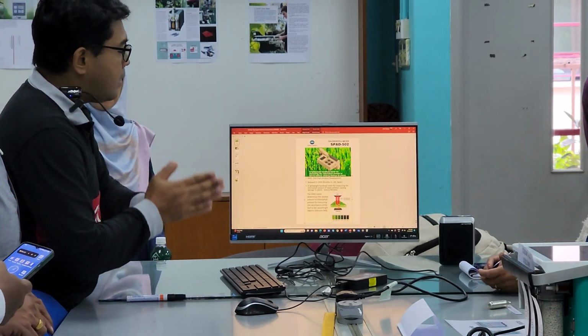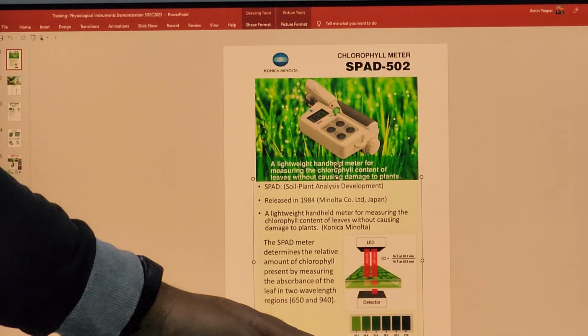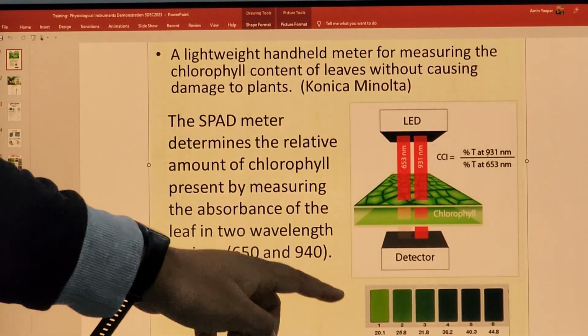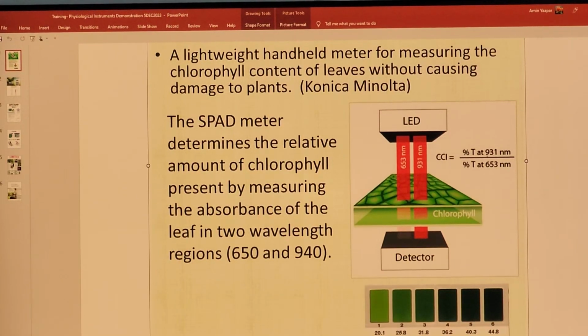So the procedure is, for each plant, you should have this chart, the color chart. For example, this is the color chart for rice. So each color, you can see it actually corresponds to a specific nitrogen level, right? So this depends not only on the fertility of the soil, but also on the phase of the plant, whether it's vegetative, juvenile, or otherwise. Because fertilizer is also input, right? That's money. All right.